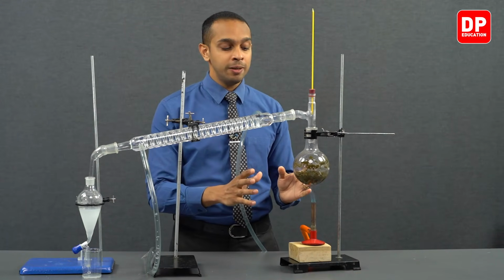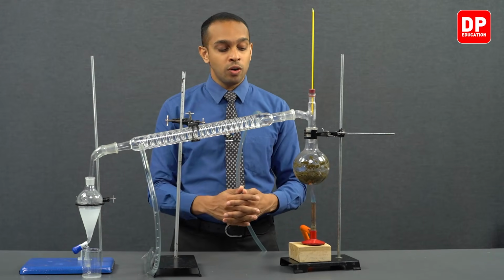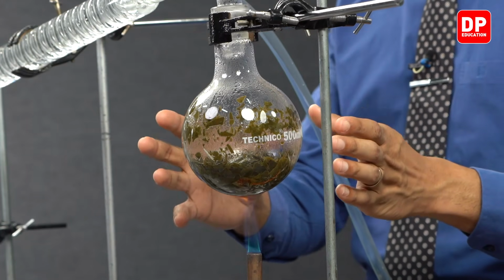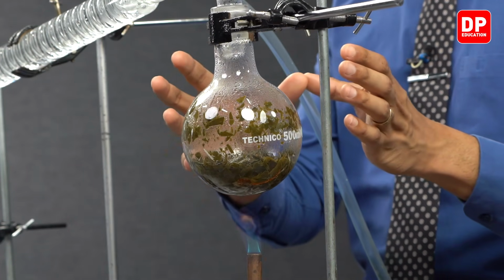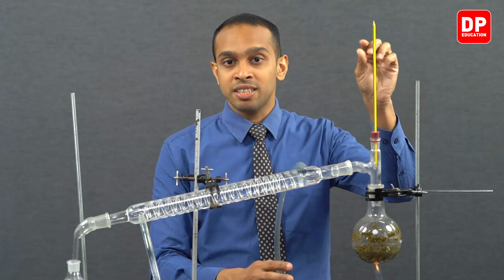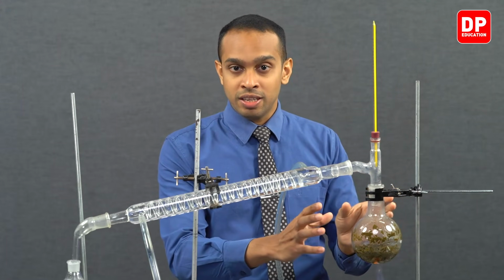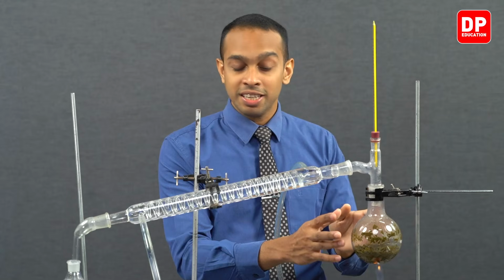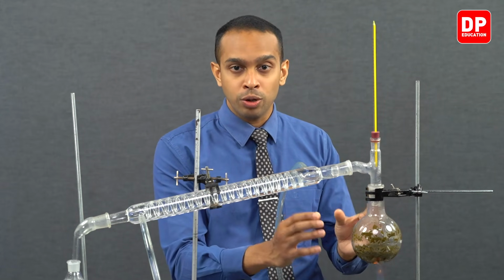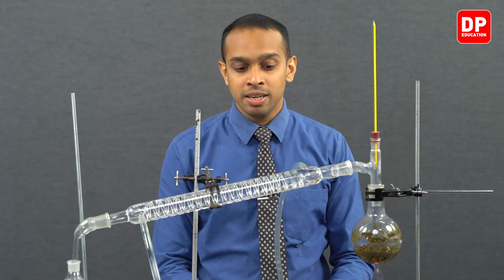Now students, we can see that the water inside this round bottom flask is almost over, meaning the majority of the water that was taken into our round bottom flask has turned into a gas, and the temperature over here is still at 99 degrees Celsius, indicating that there is still essential oil and water mixture present here. If all of the essential oil is completely gone and there's only water, the temperature will be at 100 degrees Celsius.